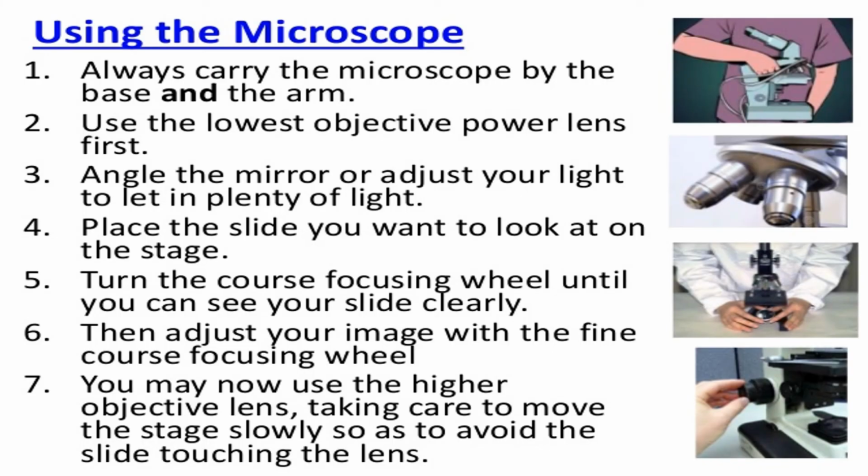Now let's proceed to the proper usage of the microscope. The first one is you should always carry the microscope by the base and the arm. So meaning dalawang kamay yung gagamitin mo. Yung isang kamay ay nakalagay sa arm, yung isang kamay naman is nakasupport doon sa base.